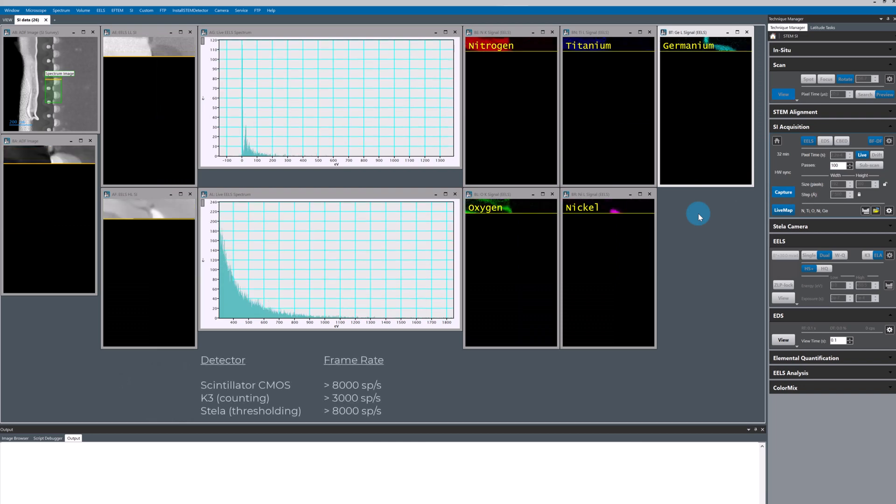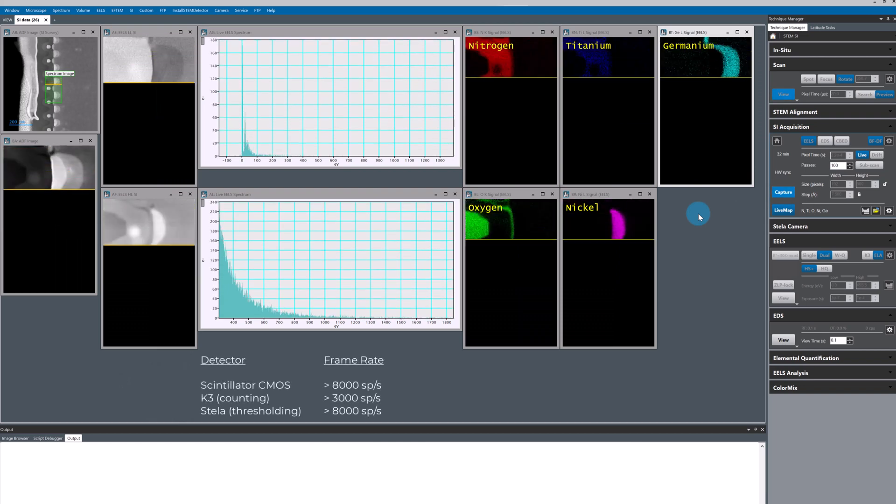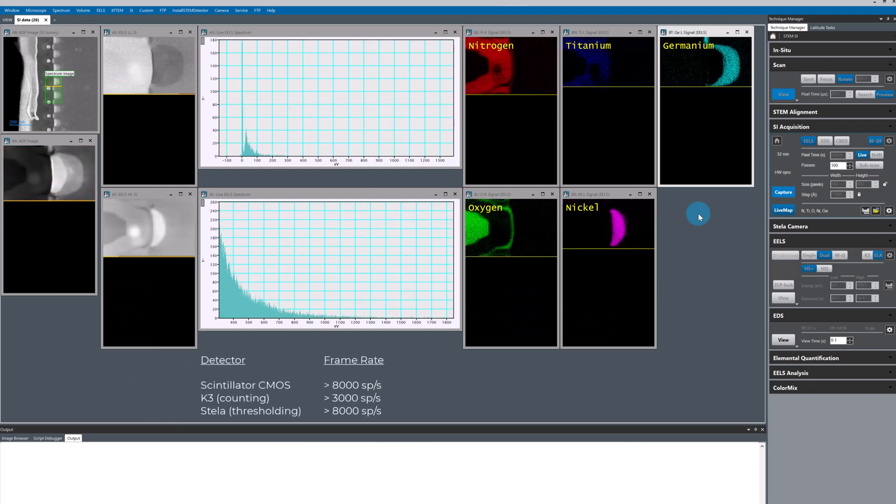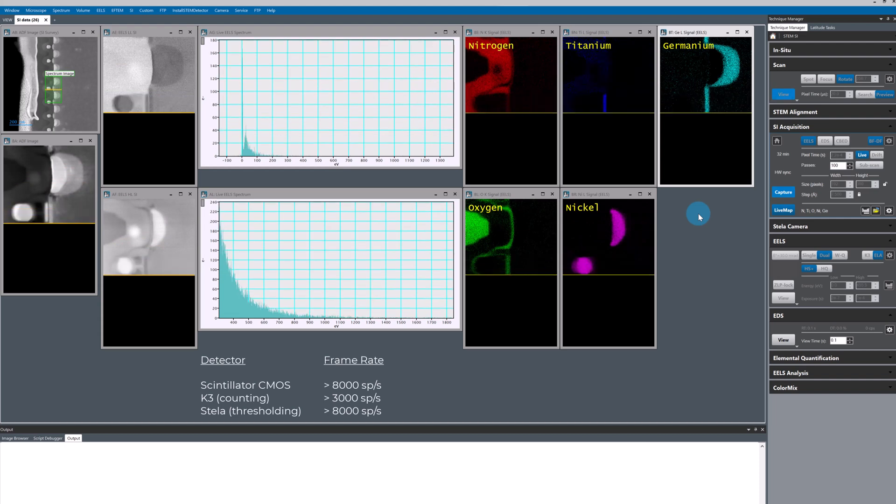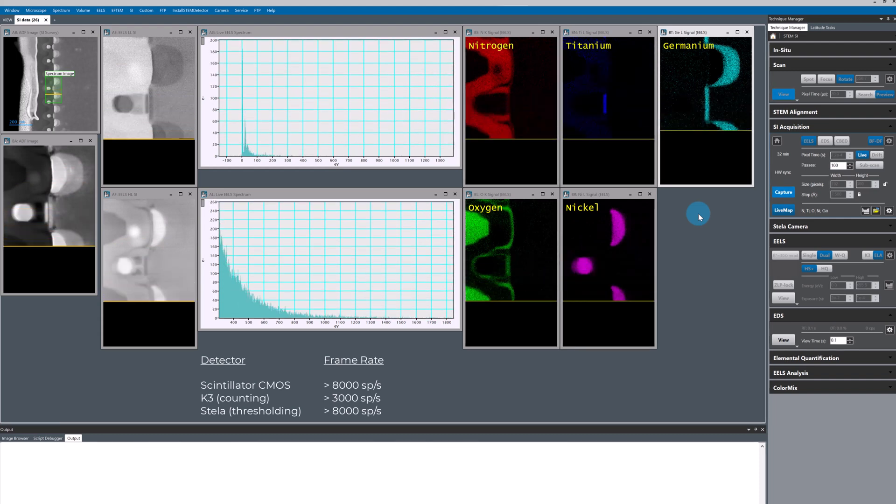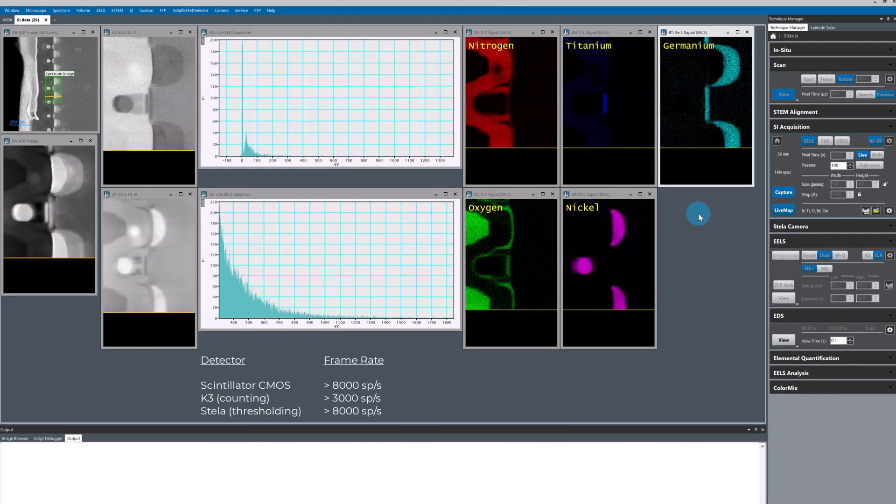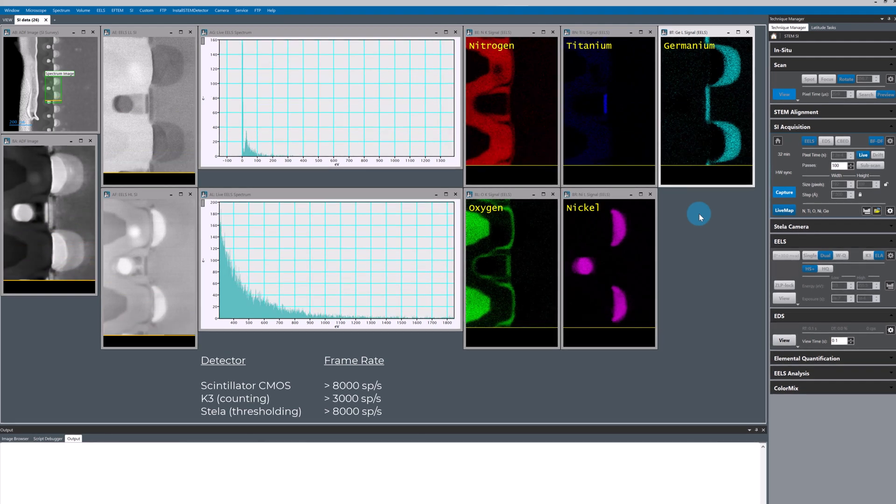All of the continuum detectors support high frame rates and multipass scanning modes. Right now I'm using the stellar camera at the max frame rate of 9000 spectra per second.